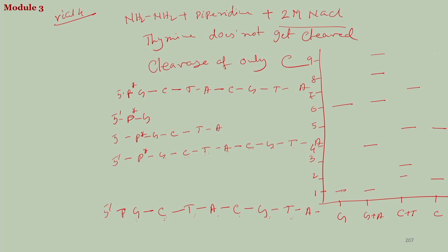Okay, so from the gel you can read the strand, and that will be your original strand. So, these are the fragments. It is a little bit complicated process, but very fine chemistry actually, very controlled chemistry that is quite selective to certain nucleobases and will not disrupt the other nucleobases. So, primarily this is a destruction of the DNA strand.